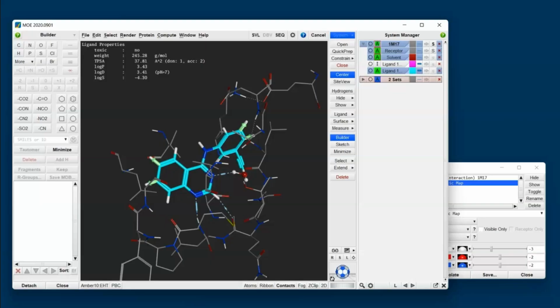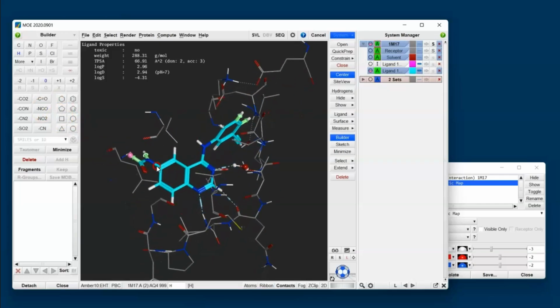So next, to create our donor feature, I'm going to add an NCO group at this R position that's been suggested by the R group vector. So I'll click NCO in our builder, and I see the NCO group is added at a sterically uncongested conformation. Perhaps this dihedral, though, is not quite optimal. So I'll go ahead and select the bond, and I could control the dihedral by using this scroll wheel that we find on the footer, but an alternative way to do that would be to use the dihedral plot.